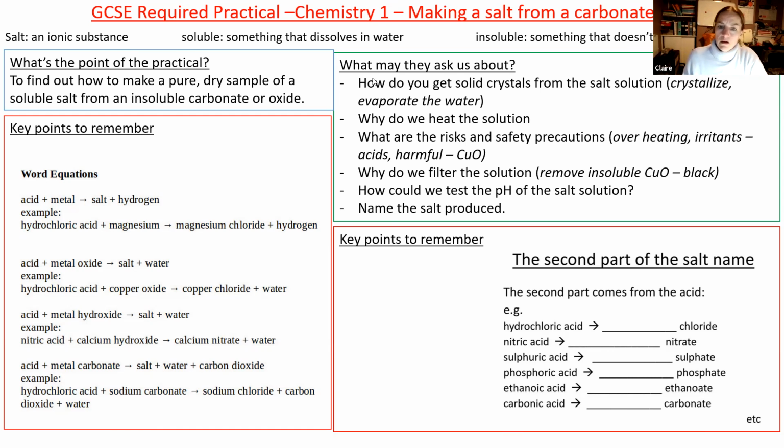Okay. What may they ask you about? How do you get solid crystals from salt solution? So this actually is called crystallize or crystallization, where you have to evaporate the water. Why do we heat the solution? That helps with dissolving and reacting the insoluble carbonate or oxide.